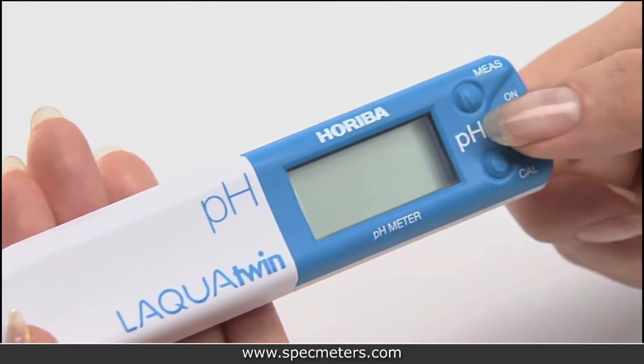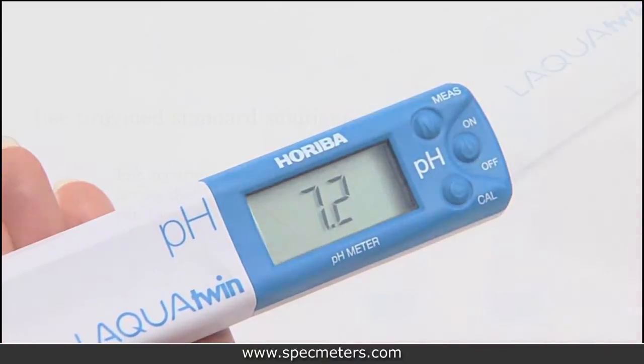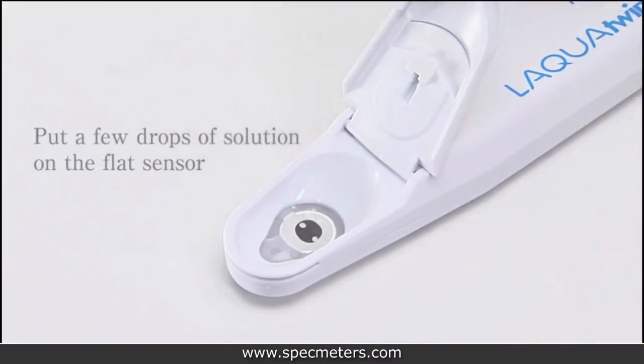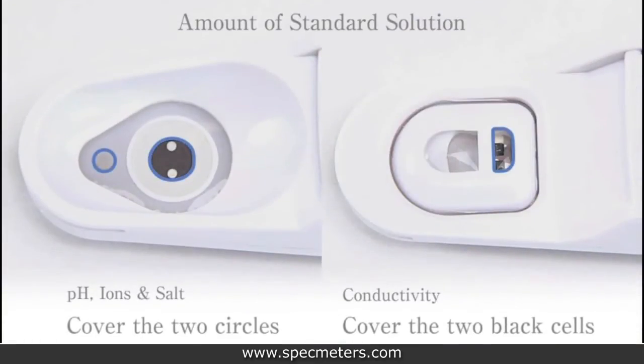First, press the on button to turn on the meter. Open the sensor cover and put a few drops of solution on the flat sensor. The amount of solution depends on which meter you are using. For pH, ions, and salt, cover the two circles. For conductivity, cover the two black cells.